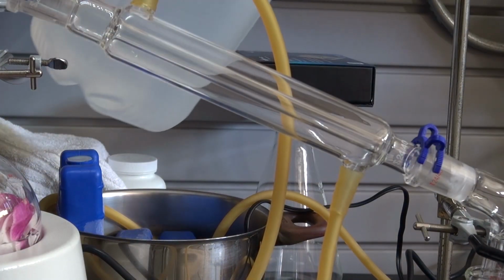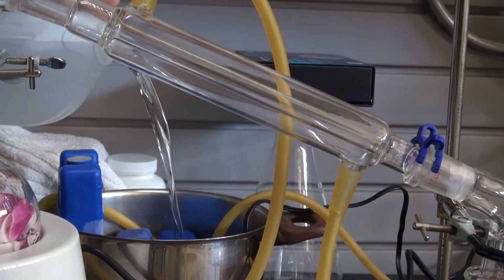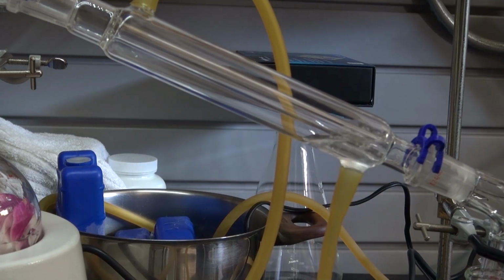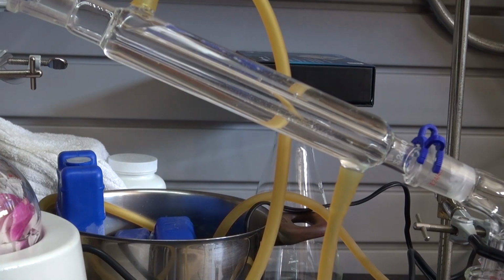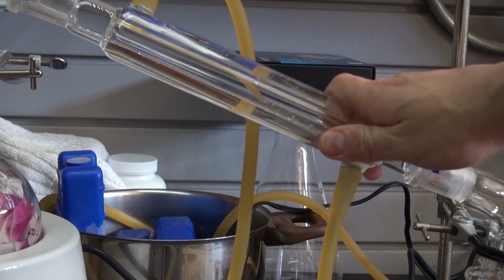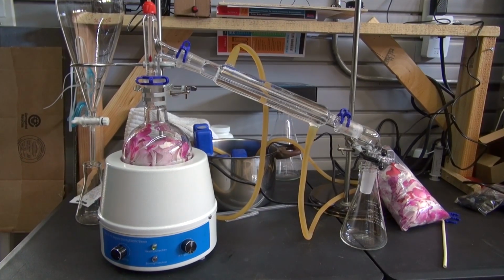Next, I'm going to fill up this pot with some distilled water and ice packs, so that I have some cold water circulating into the Liebig condenser. And now it's time to plug in the water pump, and there, the pump is on, and here's my favorite part, watching the Liebig condenser fill up with cold water. Perfect. Perfect circulation. Now it's time to turn on the heat, and we're ready to go. And there we go, it should look just like this. The heating mantle is turned on, and now the process will begin.